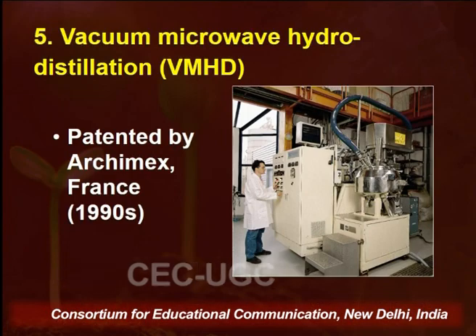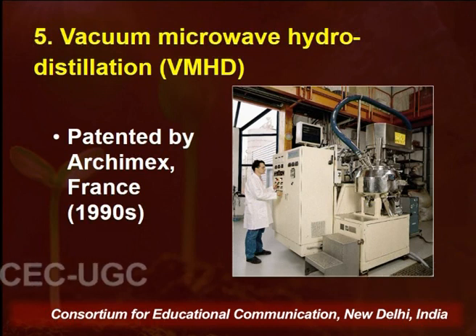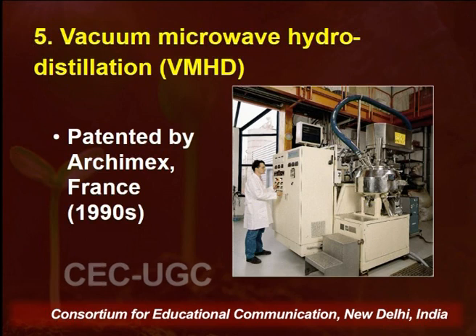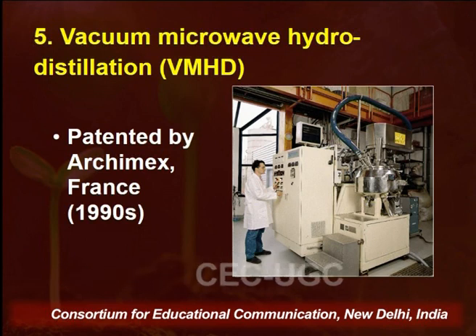Then we have vacuum microwave hydrodistillation, and this was developed by Archimex in France. Again, the plant material is heated with the help of microwave under vacuum, which fastens up the overall process, reduces the thermal degradation of the volatile constituents, and the oil is separated.